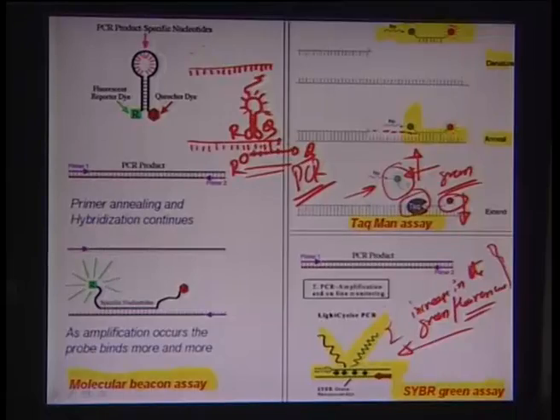The small number of complementary base pairs holding the pin part would split up, because the loop part is much larger and has much more molecular force than the few bonds making the pin part. As it flattens out, the reporter and quencher move away, and there is a sudden growth in the reporter signal.